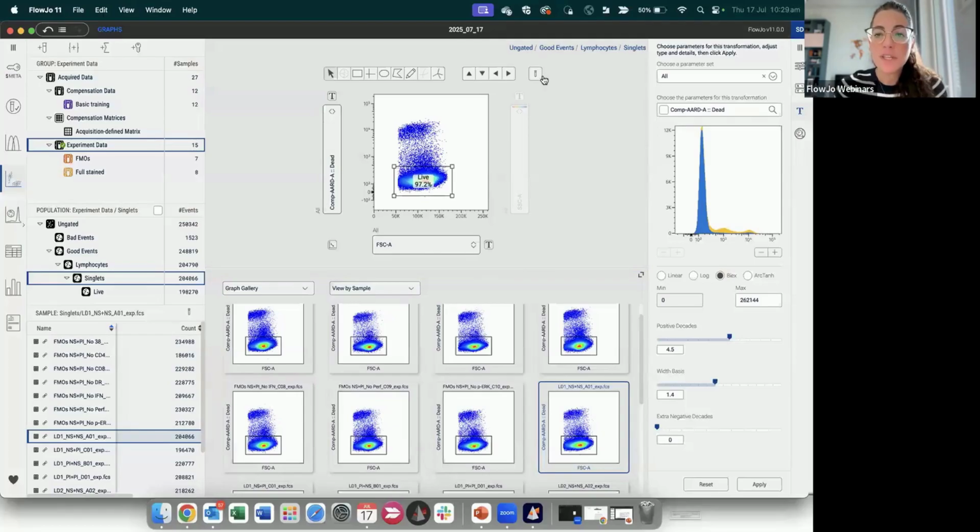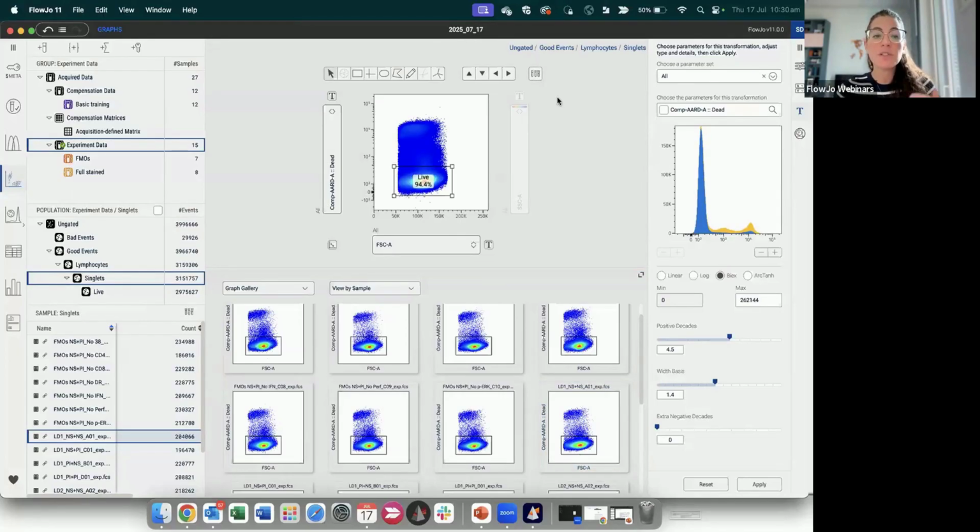This is what we call virtually concatenated file. So I can turn on my VCP. So now you see a single tube. If you click on that, you see multiple tubes. You see 3 different tubes. And now what is showing me here, it's a combination of all the events coming from all my data. So you may imagine, like, for some kind of gating, this is actually helpful because it helps you to automatically gate only once and get all the events that you need. So rather than moving from one sample to another, adjusting the gate and so on.